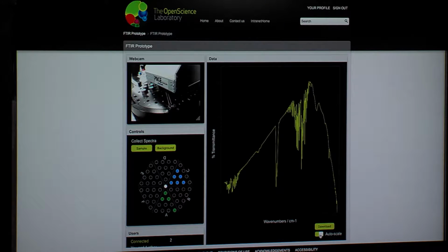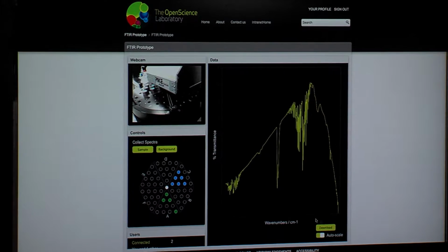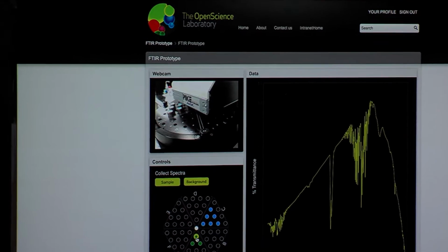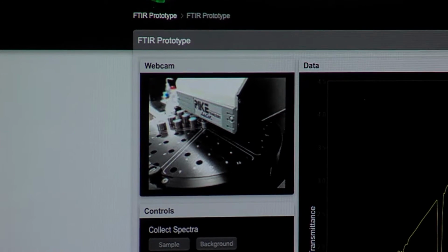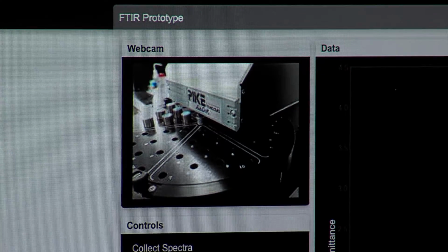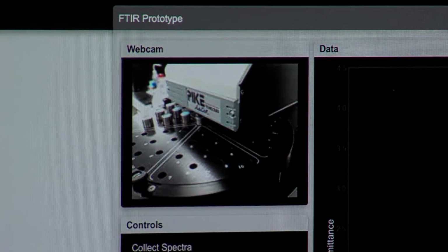Exactly. If we look at the top corner up here, we actually have a camera focused on the instrument, which is sitting in a lab about 200 metres away from where I'm sat. And hopefully, yep, it's working. Oh, wow. I'm going to control it, and it's now going to position itself ready for our first sample. Okay. So I will click the sample button.